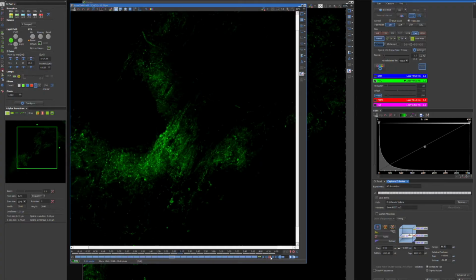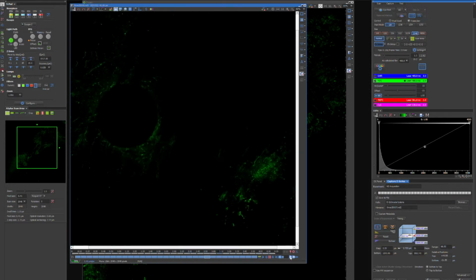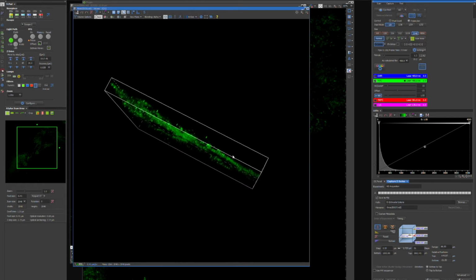This one turned out a lot brighter than the first one. I didn't enhance or brighten this photo very much, and I was using a relatively low power laser. Honestly though, I think it was too much. The microscope is picking up everything, and all these little non-neurons are just noise to me.